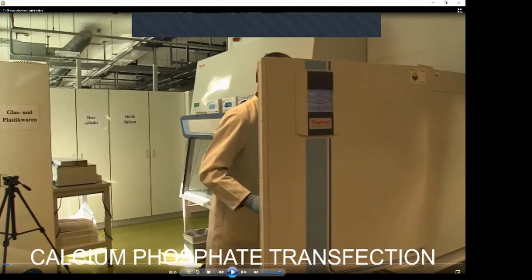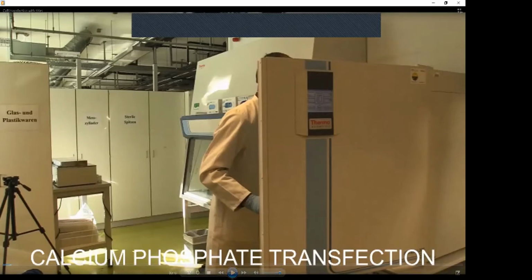So the first step was seeding of cells. What you have done yourself, you know that we have these Tis7 knockout MEFs, and that we have seeded 150,000 cells per milliliter of medium in each well of a 24-well dish. The idea is that on the day of transfection, it is optimal to have 60 to 80% confluency of cells, because then the efficiency of transfection is highest.